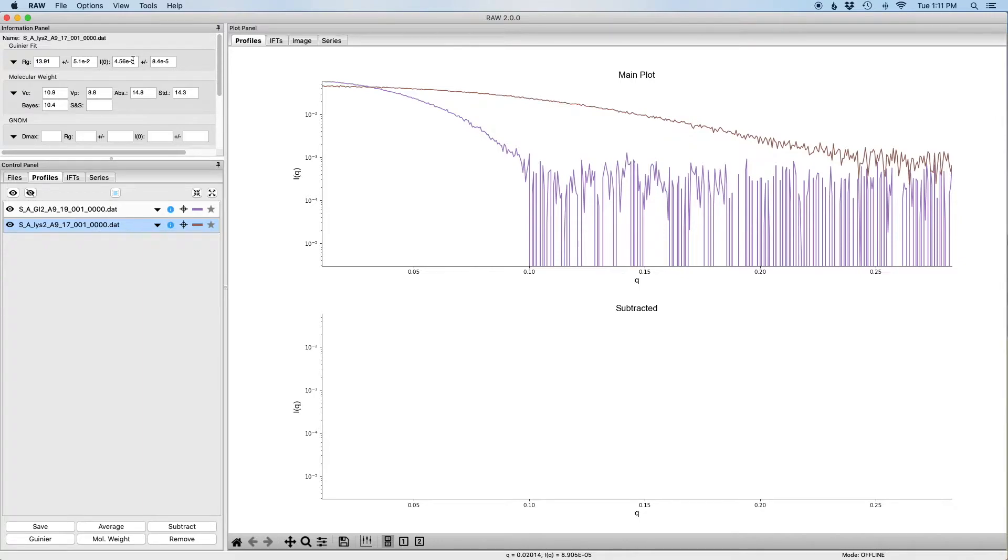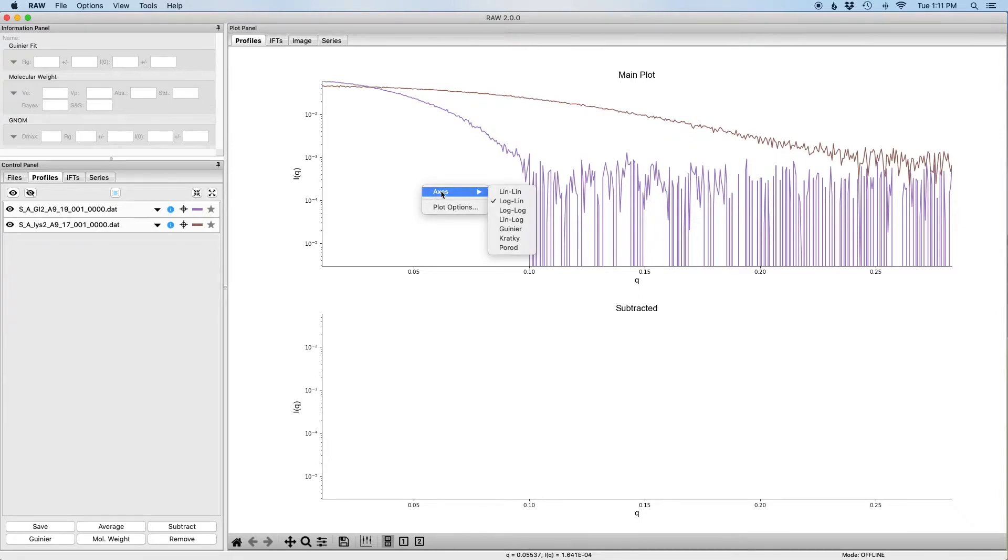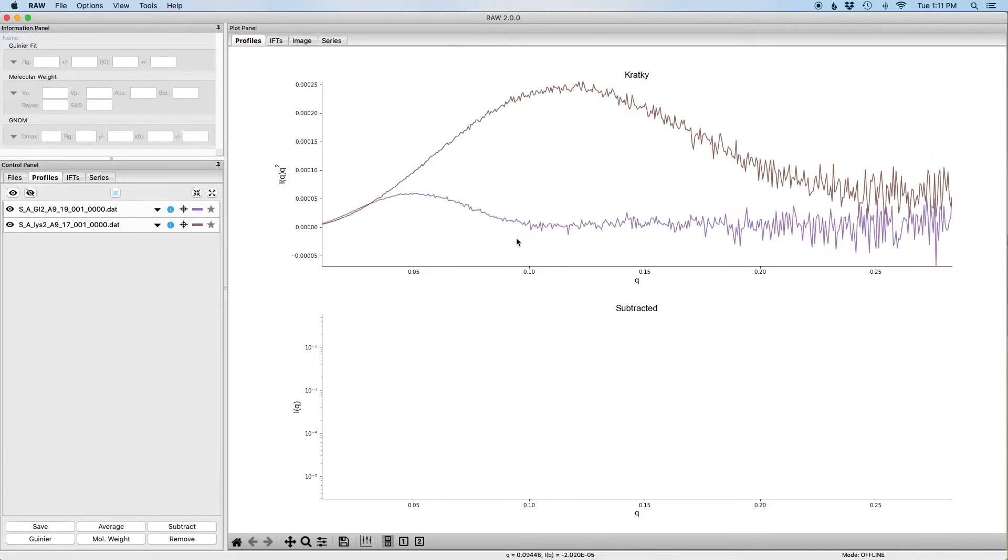If we click on the lysozyme data set, we can see it also has Guinier analysis shown here. So the first thing we're going to do is we're going to put these scattering profiles on what is called the Kratky plot. So if I right-click on the main plot, the top plot here, I pull up a menu and I can select the axes and I can select Kratky.